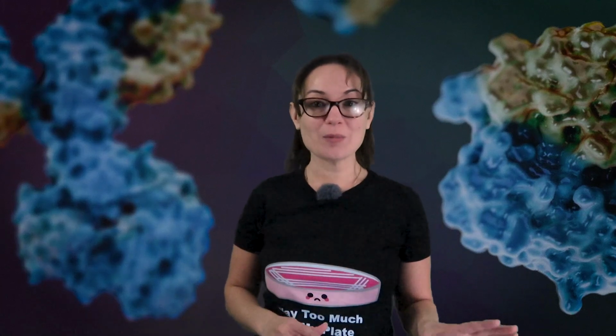Today we're talking about using affinity purification to purify antibodies. In order to give you a good overview, I'll talk a little bit about affinity purification in general and then discuss some important structural features of antibodies, because that's relevant to how affinity purification works when it comes to purifying antibodies. And finally, we'll learn about the different affinity proteins used and how to decide which one is best for you.